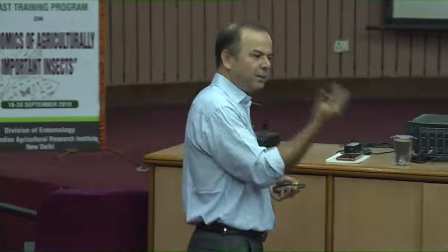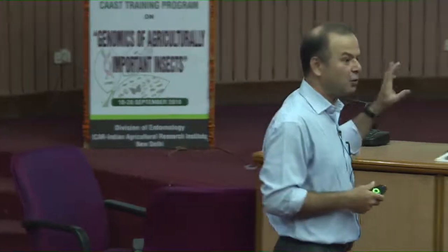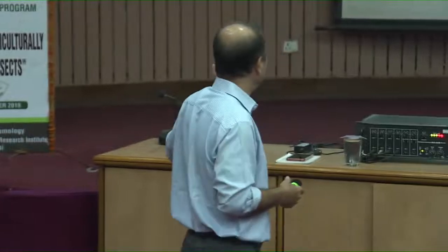For detection you can depend on a machine, you can depend on your eyes, but of course nowadays sophisticated machines are there. So, we believe those machines more rather than depending on our eyes. So, a critical amount has to be reached, at the same time you should not cross this straight line phase. Two things you have to have in mind to do the gene expression analysis, right.